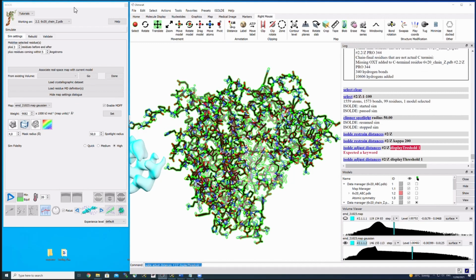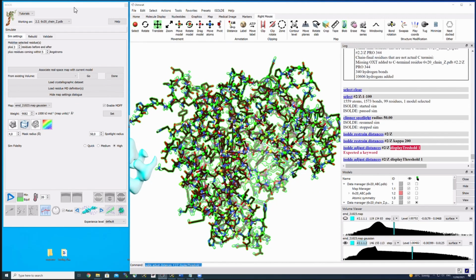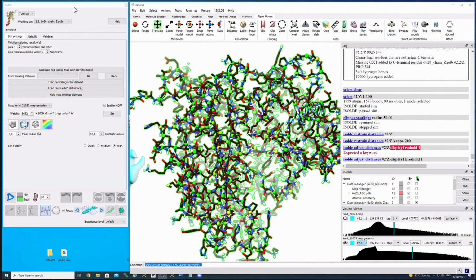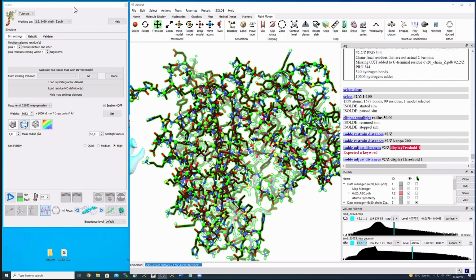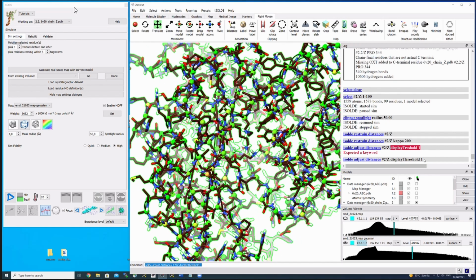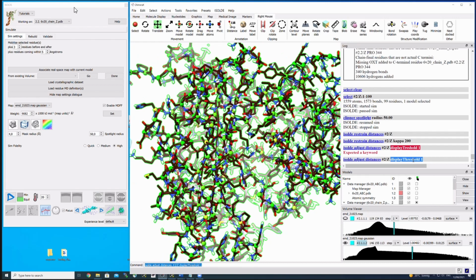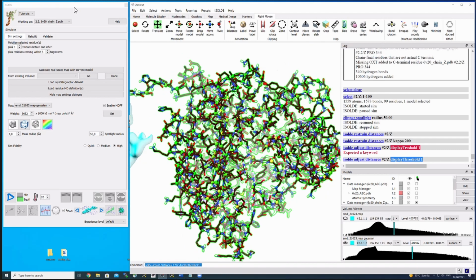If you do this, the distance restraints are still there, they're just not being displayed anymore. And that sometimes helps when you do the dynamic fitting, that you know, okay, they're there and they're acting on it, but you don't see them, so they're not obscuring the view. But whenever something passes the threshold of 1, these restraints will actually reappear, but now they don't, because this is just a static scenario. The second type of restraints are actually torsions.